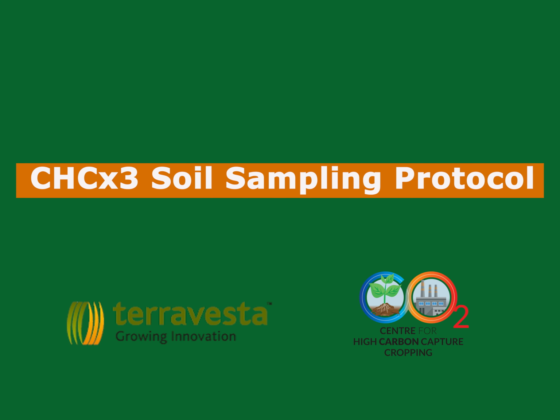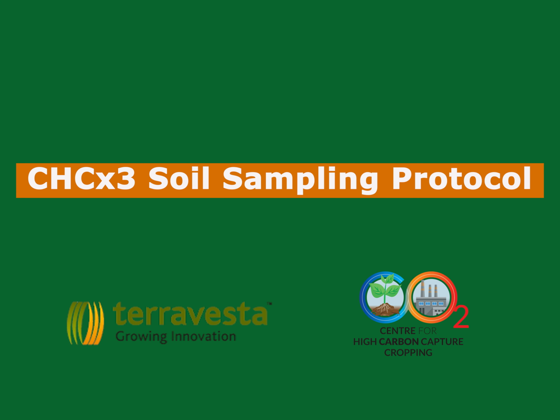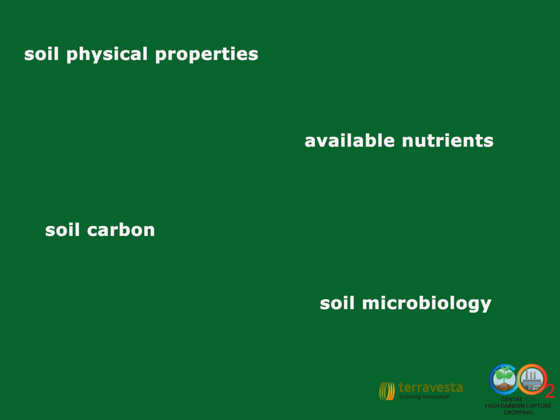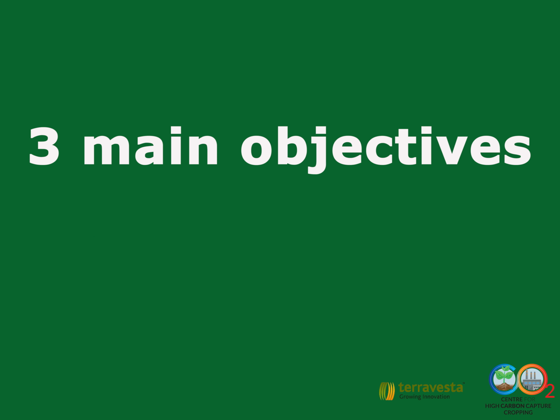This adapted soil sampling protocol by Terravesta provides guidance for other CHCx3 project partners to assess soil physical properties, available nutrients, soil carbon, and soil microbiology.